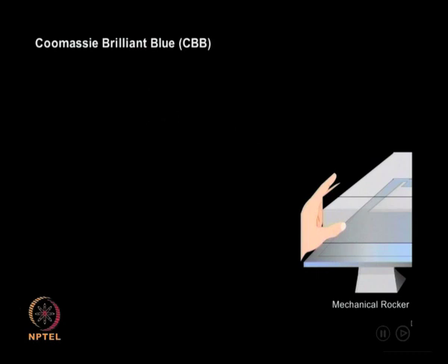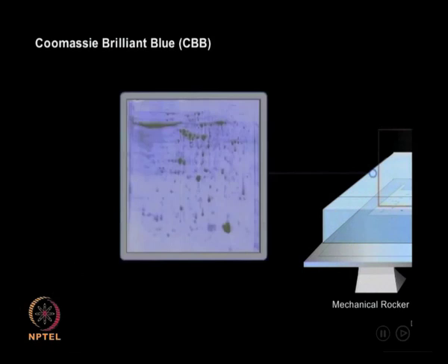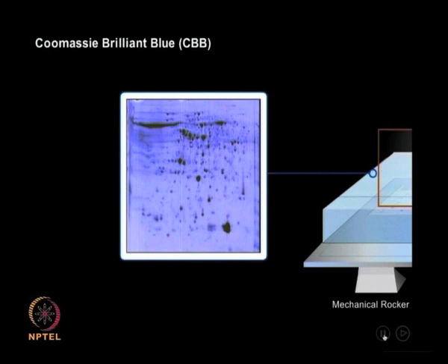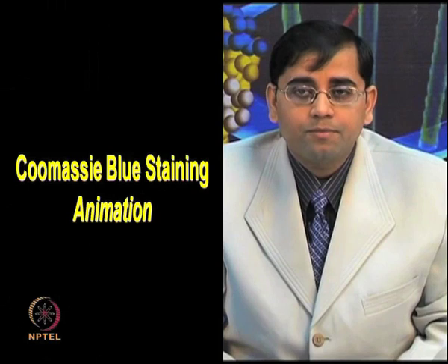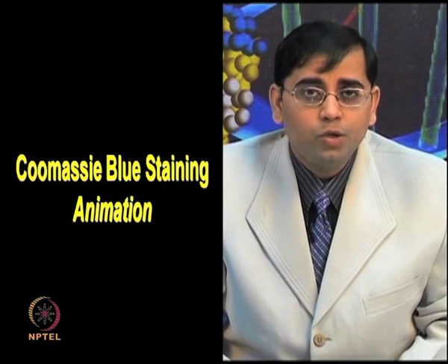Again, this process involves overnight or at least 10 to 12 hours of gentle shaking on the rocker. The stained gel can finally be viewed as shown in this image — a 2D gel stained with Coomassie Brilliant Blue — and it can be scanned using a scanner and the protein spots can be easily viewed. In this animation, you are able to see how, after performing 2D electrophoresis, you add the Coomassie stain on your gel, perform the staining and de-staining procedure, and visualize your blue spots on the transparent background. Each of the spots can now be used further for image analysis.